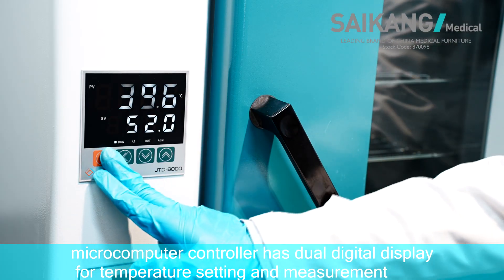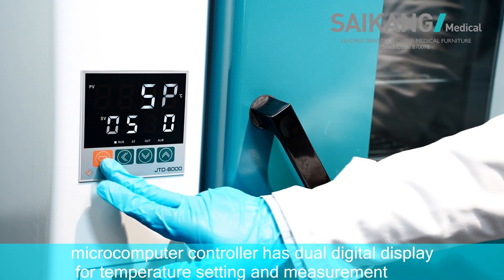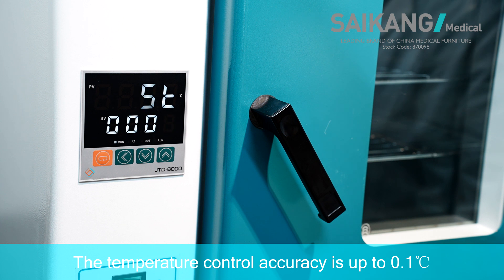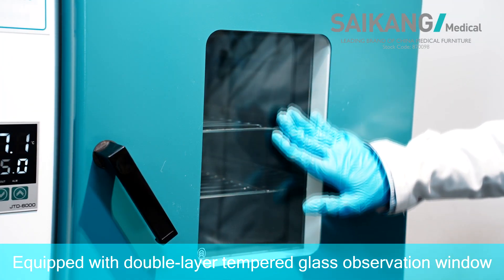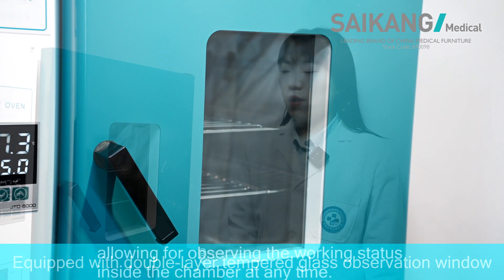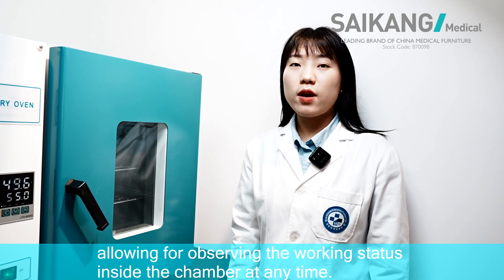The microcomputer controller has dual digital display for temperature setting and measurement. The temperature control accuracy is up to 0.1 degrees centigrade. The dry oven is equipped with a double-layer tempered glass observation window, allowing for observing the working status inside the chamber at any time.